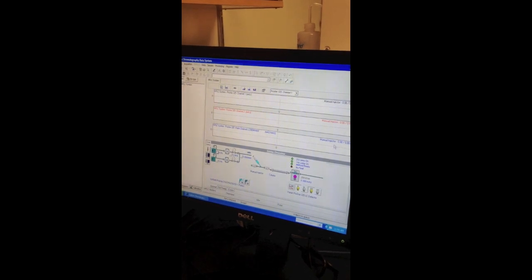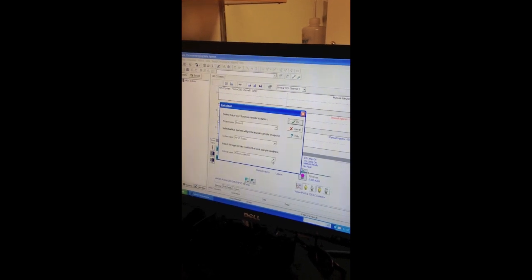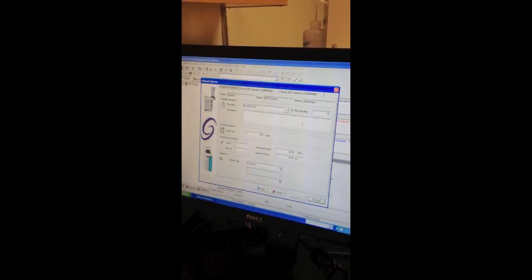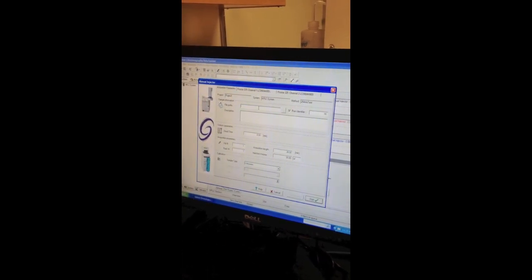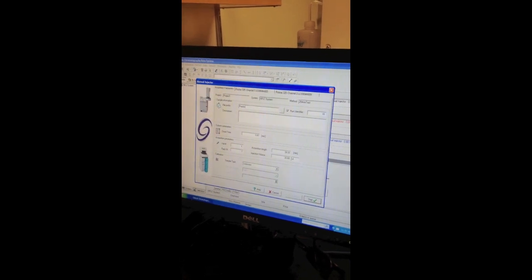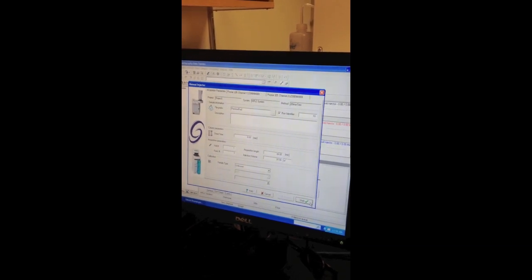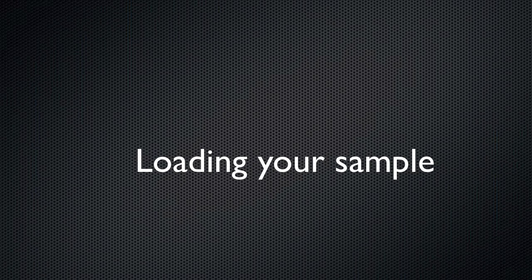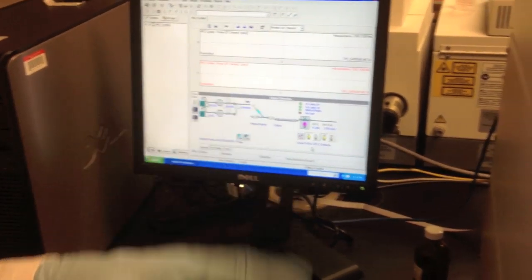So sending the method over. Go to Acquisition, the dropdown. Click Quick Start. Choose your method name. Click OK. Change the file prefix to whatever it is, the sample that you're running. So once you've pressed start, it's going to send over the method and it's going to start. The machine is actually going to start pumping.